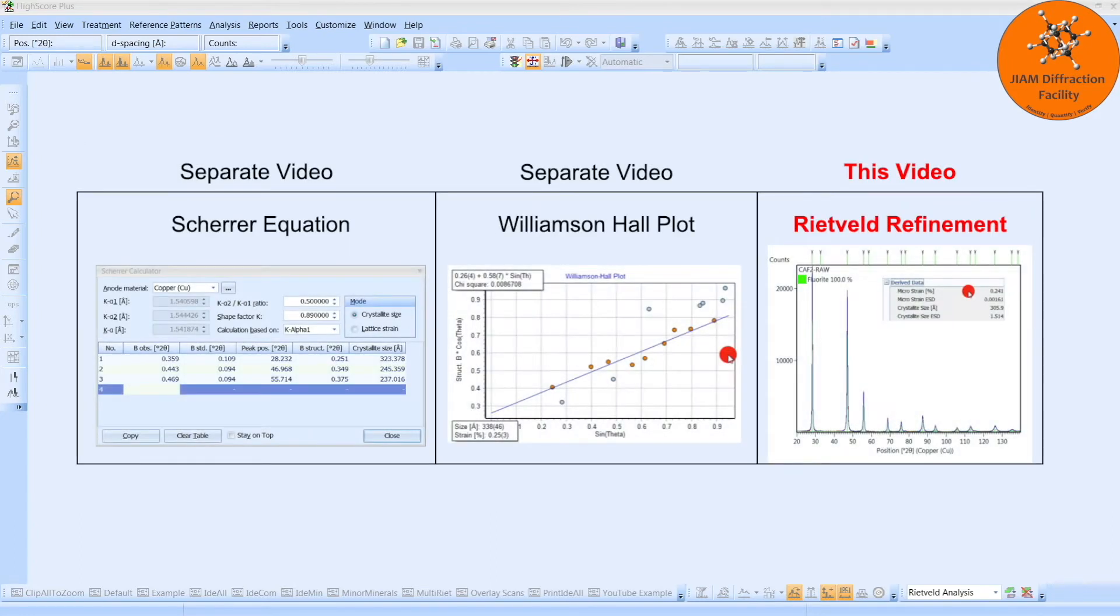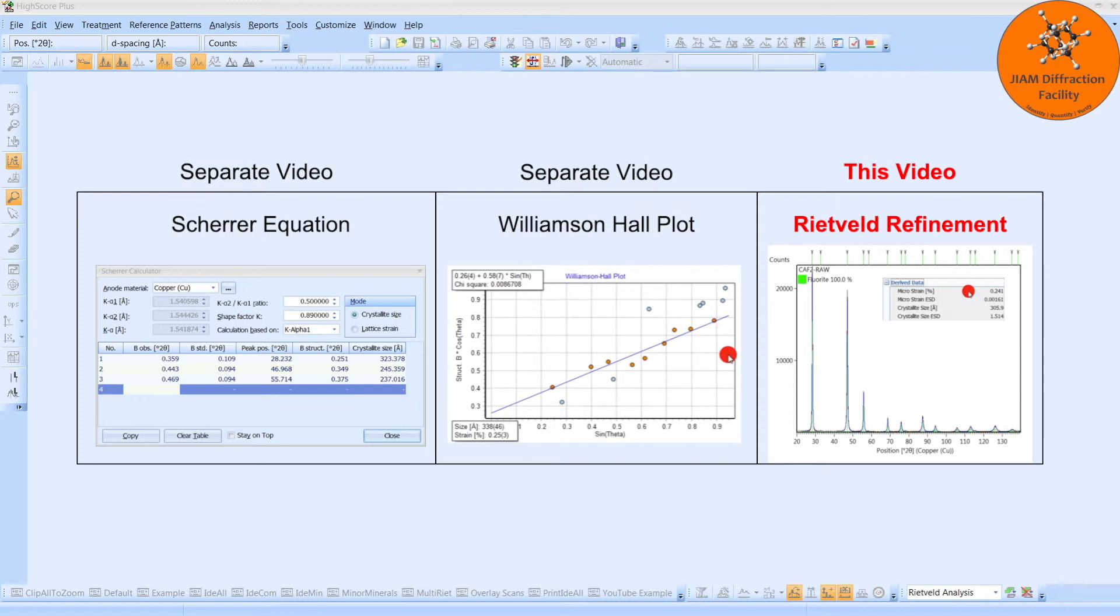This video covers how to determine the crystallite size and microstrain using Rietveld refinements. I have another very similar video to this one that analyzes my own data, but I am including this one so that you can see how to analyze the practice data provided by Panalytical, and to compare the results to those obtained using the Scherer equation and a Williamson-Hall plot.